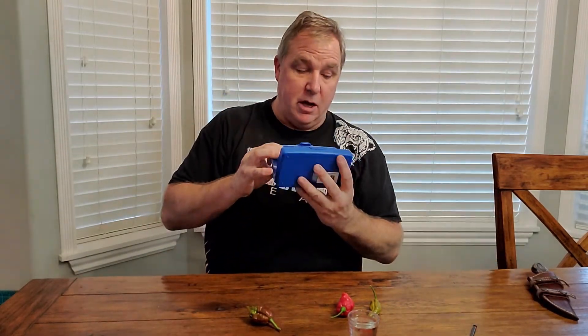This is the SX610 from Apera — a great meter. It's compact and you can carry it anywhere where accuracy is important. We're not scientists or professionals, but we do want accuracy in what we're seeing.